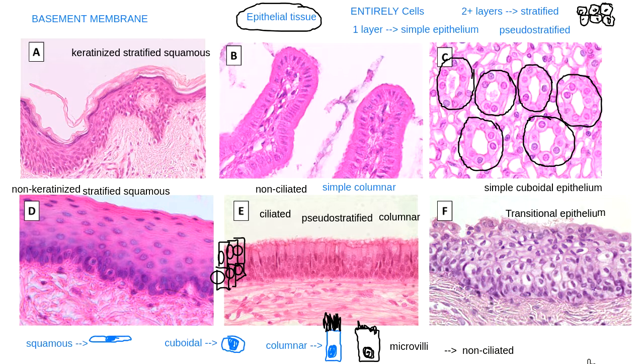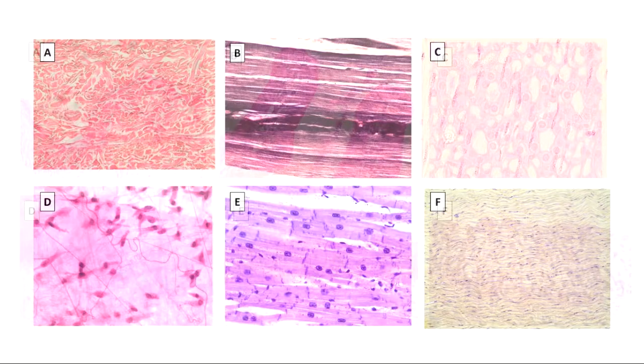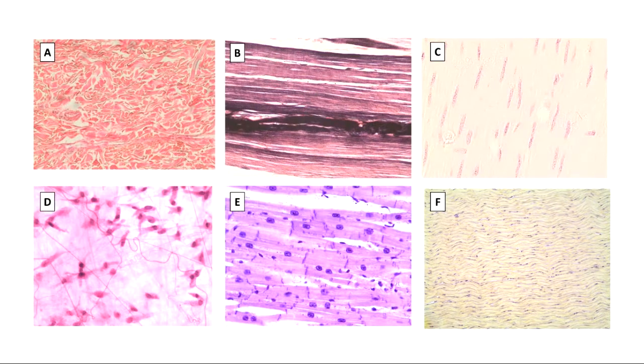All right, we talked about many of the major, not all of them, but many of the major types of epithelial tissue. If you want to keep practicing with tissues, that midterm review assignment has lots of groups of tissues that you can practice on. So these were all epithelial tissues. On my next slide here, we actually have a mix of types of tissue.